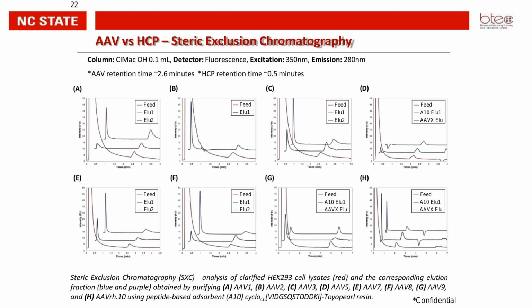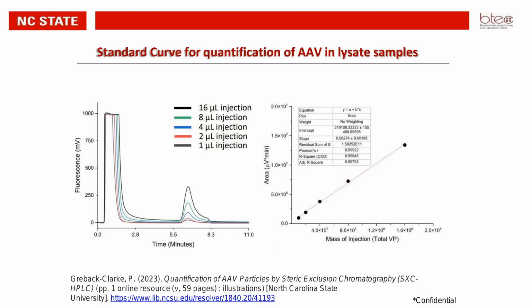Again, I just wanted to show you guys that it works across the board. Different serotypes work. Everything can be tested on this particular method. One more interesting thing about this method is a student worked on it. He was the one who actually designed the steric exclusion method.